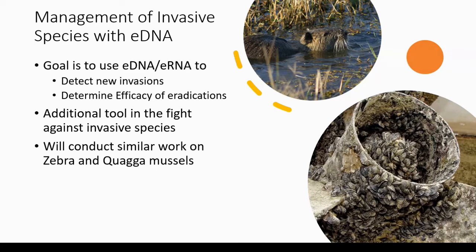And so we have a lot more work to do on this project to test. That was all done with just nutria DNA. Now we're moving on to tests with eDNA. We have a lot more work, but we're really excited about moving forward with this.